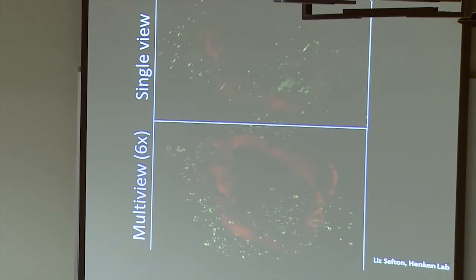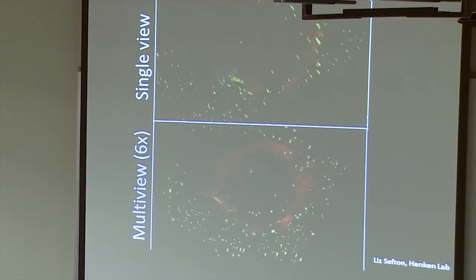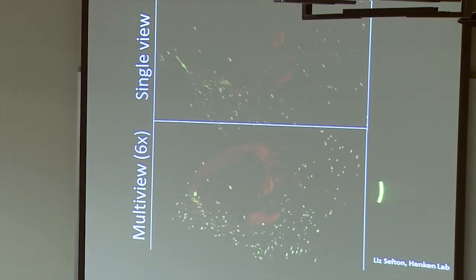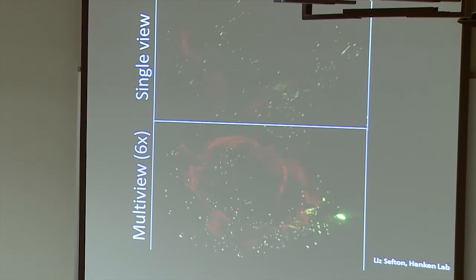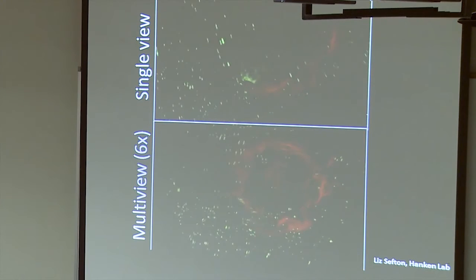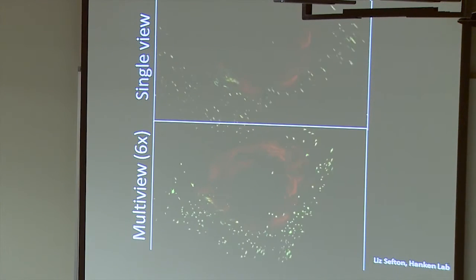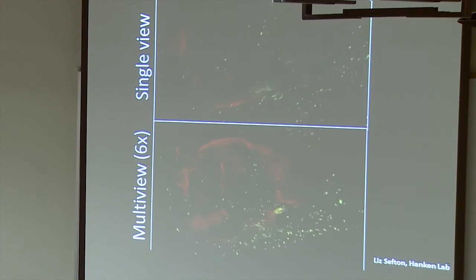These little green dots floating around on the outside are fluorescent beads, and those are placed in the agarose outside the sample. That's what's used to overlay all of those different angles onto one another. This is all done computationally afterwards. They can be removed, but it's a bit of a painstaking process. These were actually green beads with phalloidin 488, so green beads, green fluorescence, that's why they're all there. The easier way to do this is to use red beads with a green sample, and then you don't have to worry about seeing them. Or use smaller beads that are actually dimmer than your sample, so that you don't actually see the beads and you just see the sample once you reconstruct it.